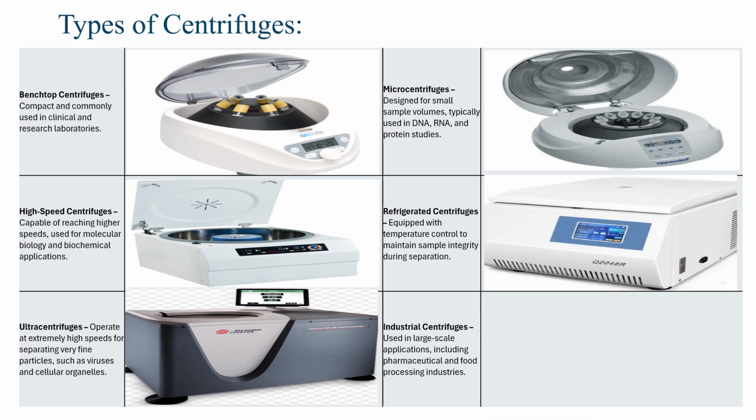Next one is the refrigerated centrifuge, right? Refrigerated centrifuges are equipped with temperature control to maintain sample integrity during separation. They are essential for processing temperature sensitive samples in biological and biochemical research and also in the pharmaceutical industries, right?